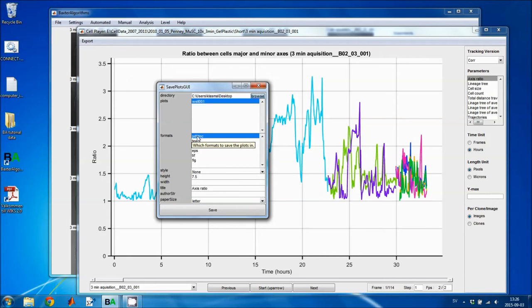The PDF doc will create a PDF where each plot has a separate page, and there's also a title page. And then TeX will create a LaTeX document that can be compiled into that PDF document. And if you want to make changes to the PDF documents afterward, you should save the TeX document as well. Otherwise, that's just removed.